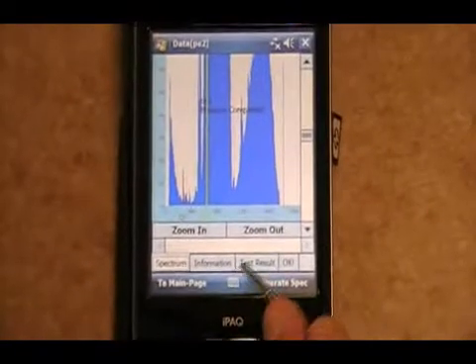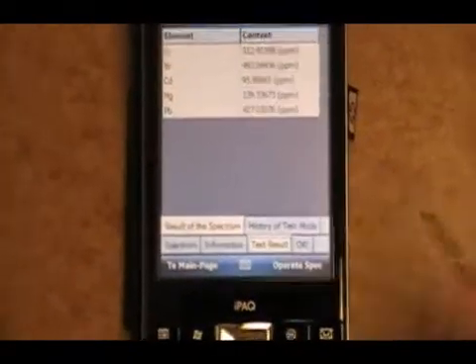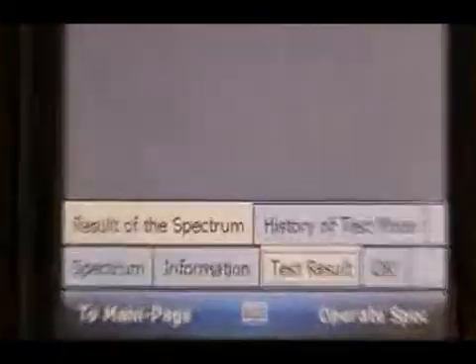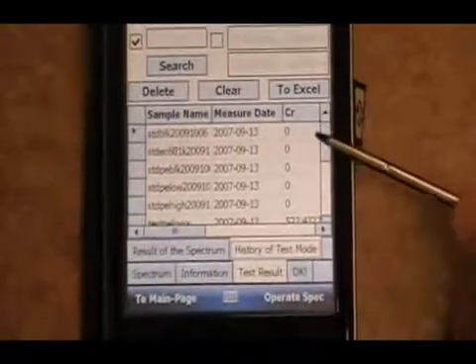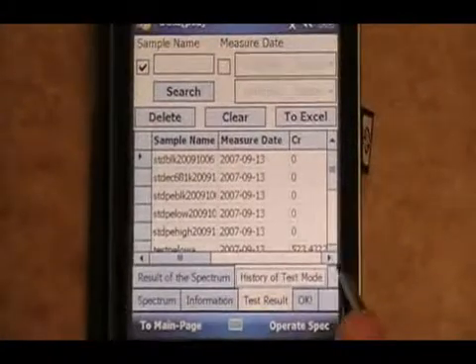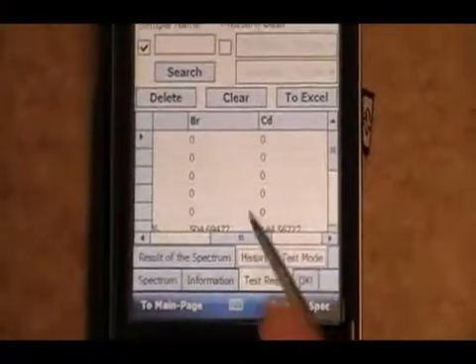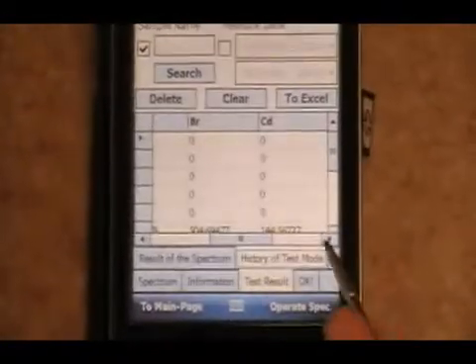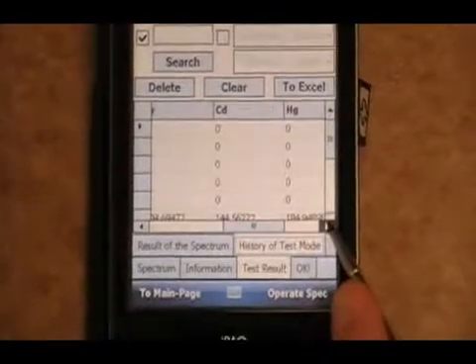Also, at this point, with it finished, you can look at the test result, which is where we were running, and the history of the test mode. In the history, it'll show everything that was run for that specific mode. The code, the specific analysis numbers, will be over here to the right.